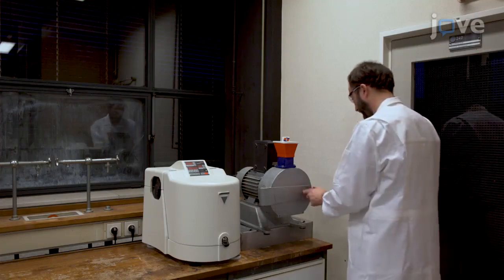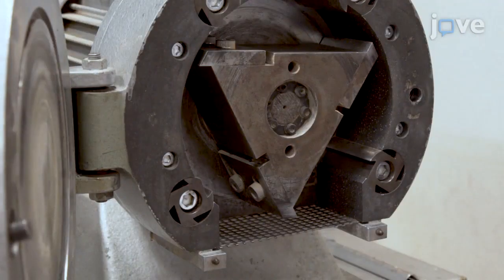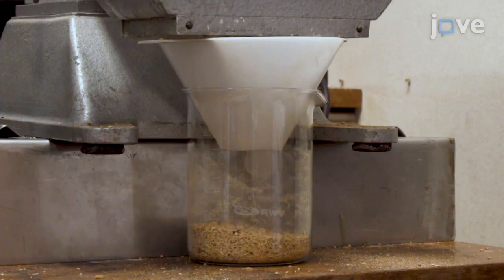To produce cut walnut shells, equip a hammer cutter with a 5mm sieve at the outlet and feed the walnut shells into the hammer cutter, collecting the fractured shells in a 1L glass beaker.